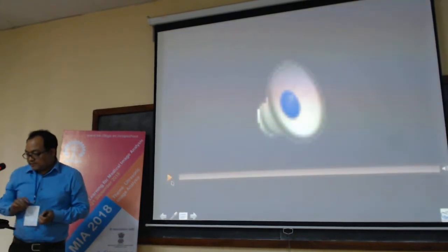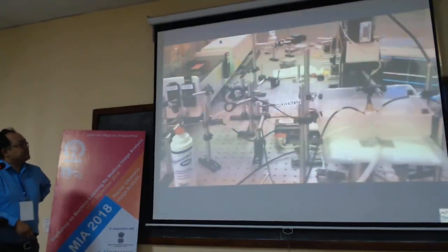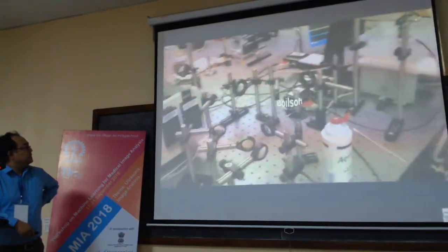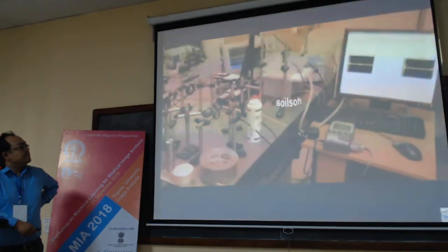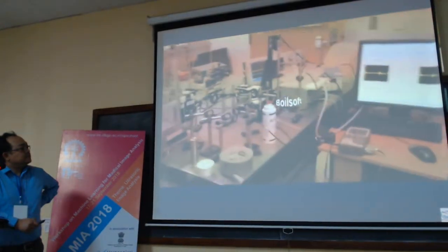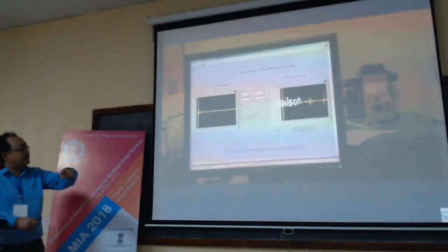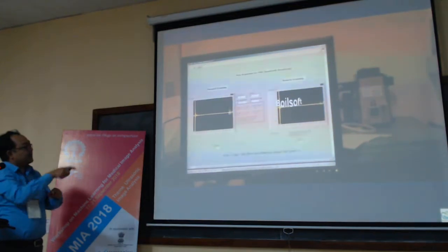For briefness, I am just playing the video that we took during the experiments. I have this one target. When the signal is crossing this target, the signal becomes higher.